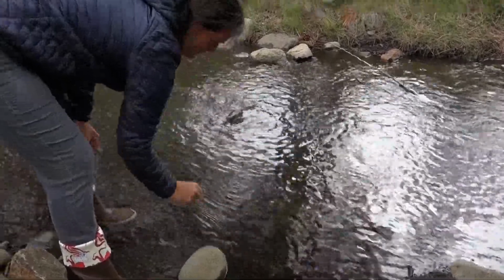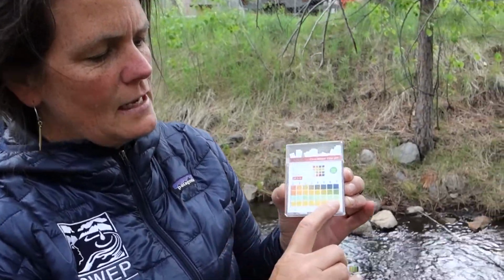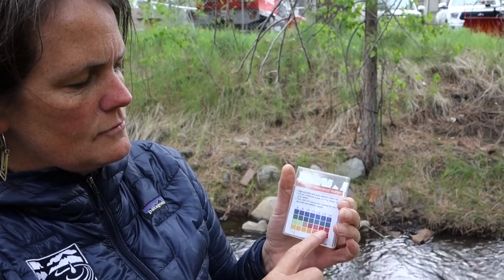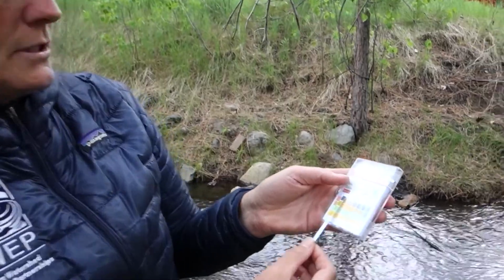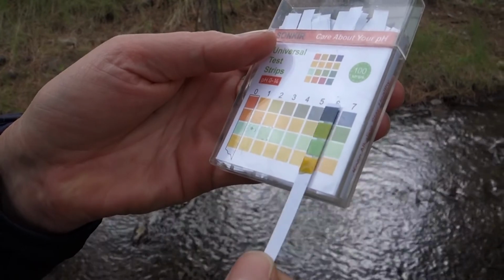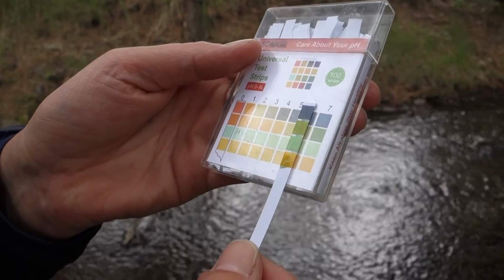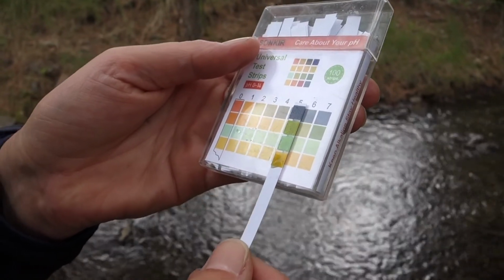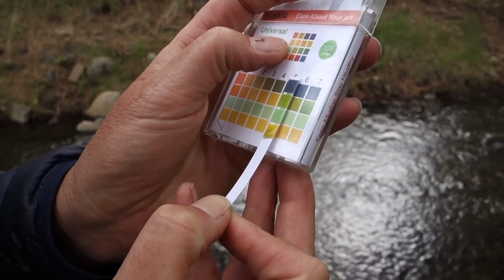It reacts pretty quickly. And then you're going to take the strip and match it to the scale on the box. The pH scale wraps around the box. It starts here, 0 to 7, and then if you flip it over, it continues 8 to 14. You're going to line your colors up on the scale to find the best match for all 4. And so for here, I think it's between a 6 and a 7. So I'm going to say, because this green is a little bit lighter, it's a 6.